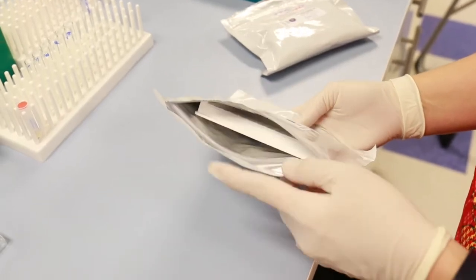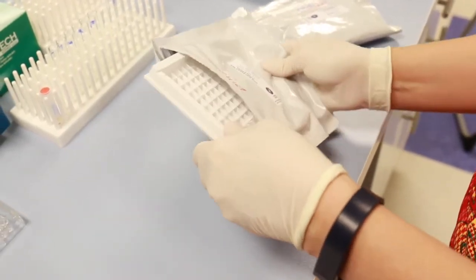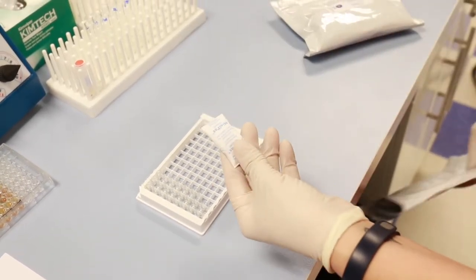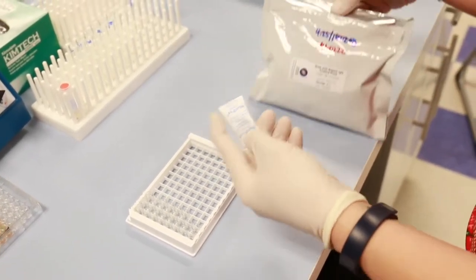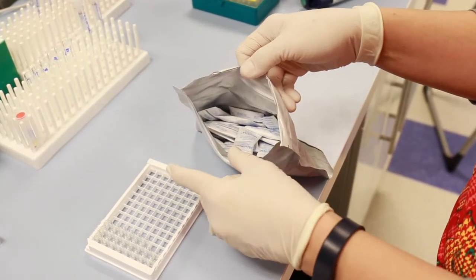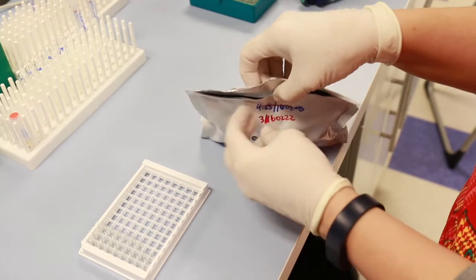It is important that antibody coated plates remain dry while they are being stored before use. After completing one of our assay kits, we recommend that you retain the desiccant packs in a dry place.